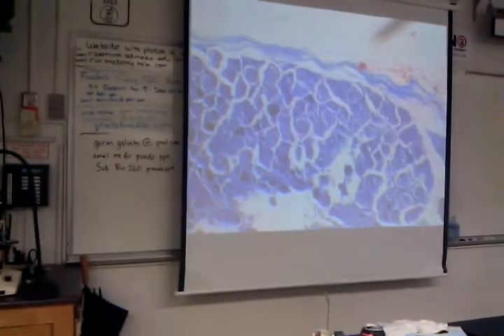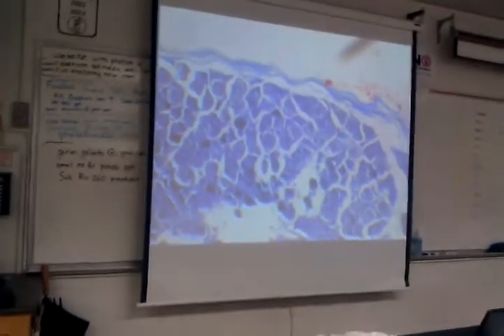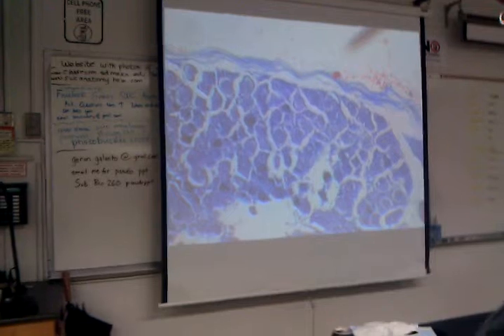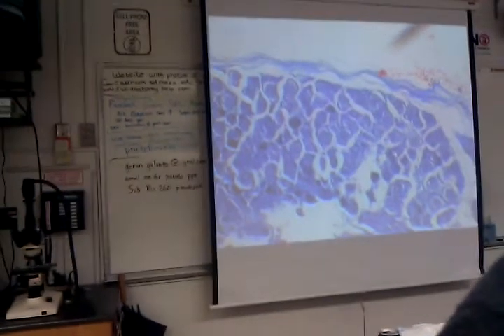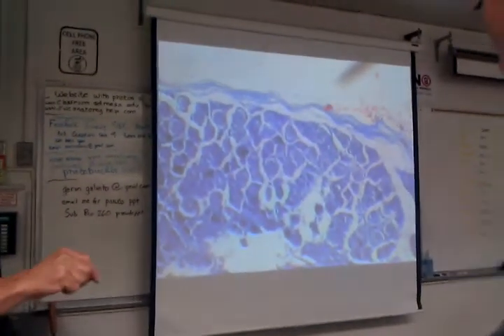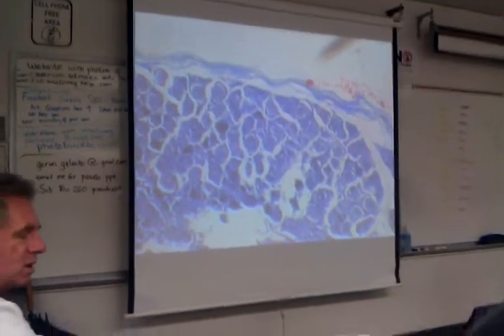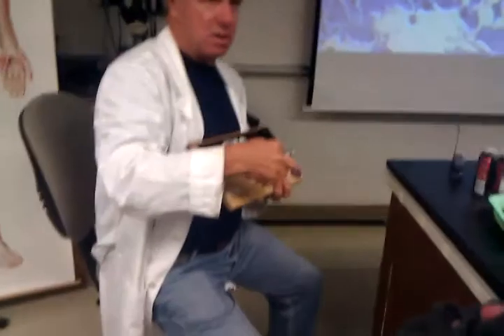Sensory neuron cell bodies. So what's happening is, remember, sensory input information comes in to the spinal cord through the dorsal root, right? These are cell bodies of sensory neurons, which are always clustered in this thing right here, the dorsal root ganglia. So sensory information comes in, passes through this, and then goes into the cord.